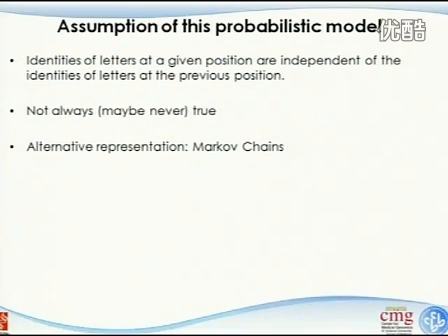Now, how are we going to use ChIP-seq data? How can we use this in ChIP-seq data to study the binding sites?